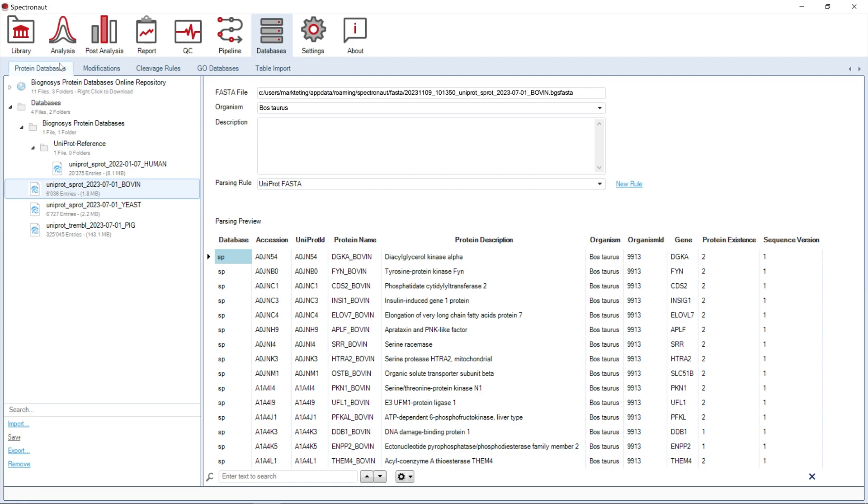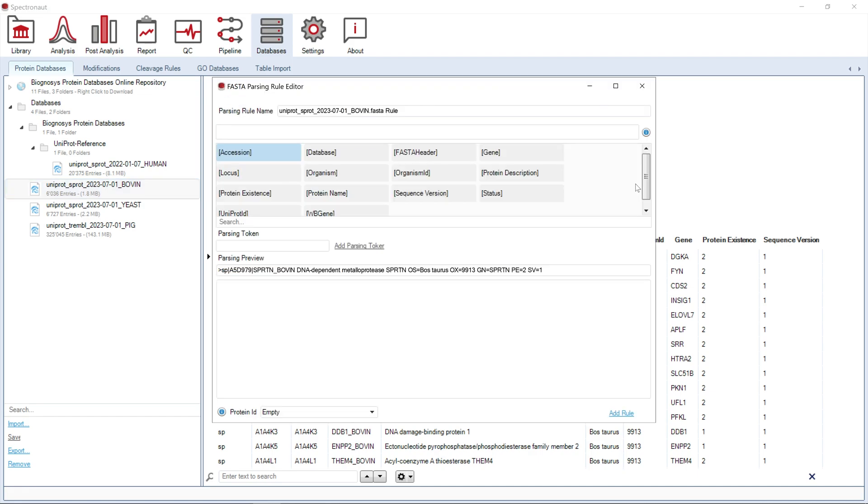Spectronaut already contains the UniProt parsing rule, but you can add a new rule by clicking New Rule in the Protein Database page or later during importation of a chosen database.